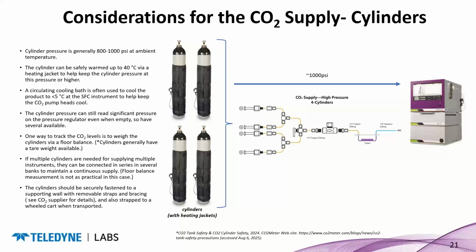Now these have to be transported, so they have to be strapped down to whatever cart you're using to move the cylinders around in the lab and to your loading dock, either for removal or for bringing up to your lab. They should also be strapped to the wall when in use. You don't want them falling over.